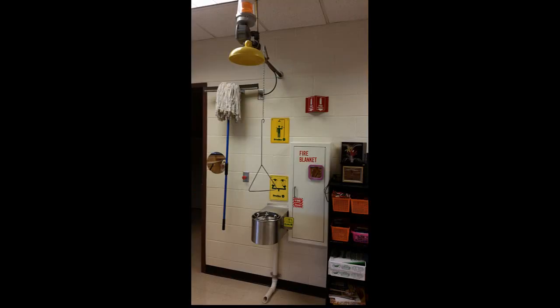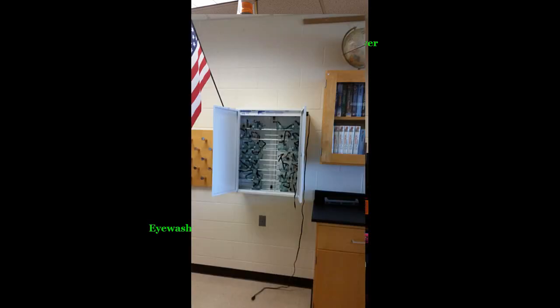And then number 19, know where the safety equipment is, know where the exits are in case there's an emergency or a fire drill. Fire drill, we just go down to the right in the hallway and out that back door. Chemical shower, we won't be needing it, but if, let's say, we were doing something with chemicals and you needed to get them off, the chemical shower is near the door. The eye wash station is part of the chemical shower. You push the paddle back and 2 little streams of water come out, aim directly into your eyes. You need to stay there for about 10 minutes to make sure your eyes are fully rinsed. It would not be pleasant, so that's why you should keep your goggles on.